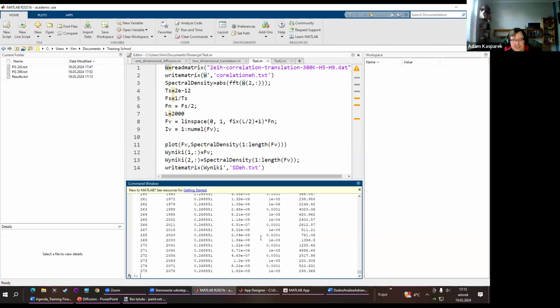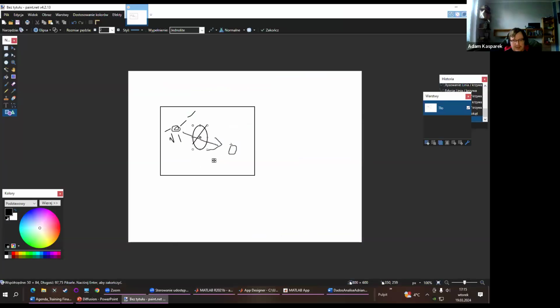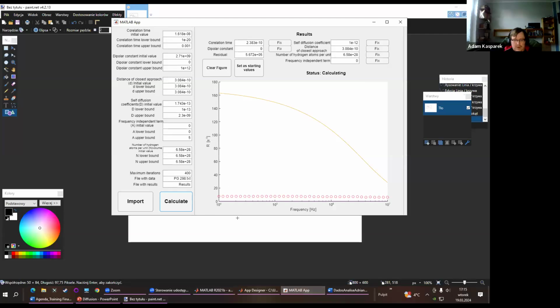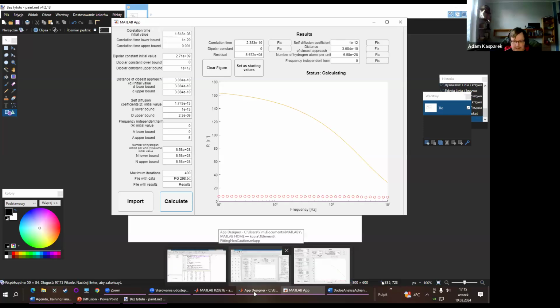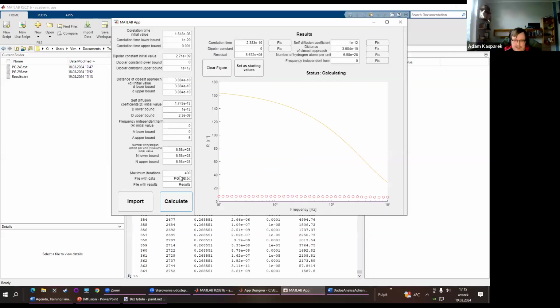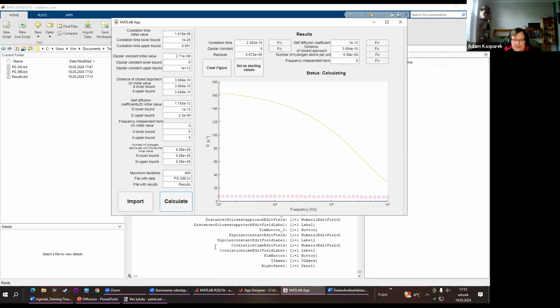It actually doesn't change, because it is going in a circle around the correct answer. Or I believe it's going around the correct answer. I don't know that. It cannot get to the correct results. But for that reason, I put in this maximum iteration of 400. So if I see that it doesn't change for so long, I can review. Oh, actually, it found something near.